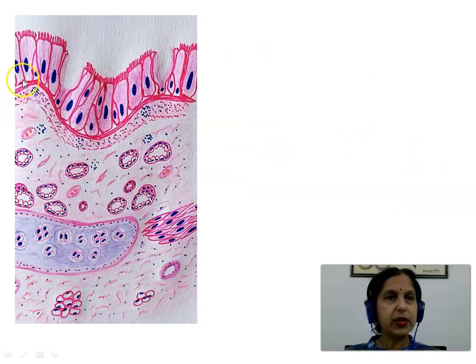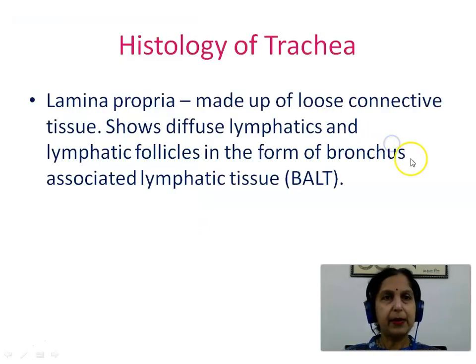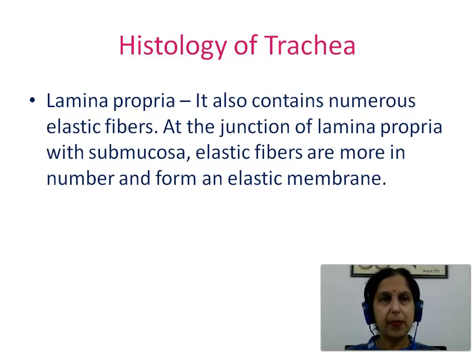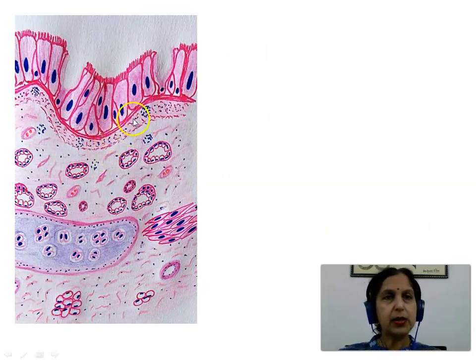The epithelial lining rests on a thick basement membrane or basal lamina. We then see the lamina propria, which is made up of loose connective tissue. It shows diffuse lymphatics and lymphatic follicles in the form of bronchus-associated lymphatic tissue (BALT). It also contains numerous elastic fibers. At the junction of the lamina propria with the submucosa, elastic fibers are more numerous and form an elastic membrane.